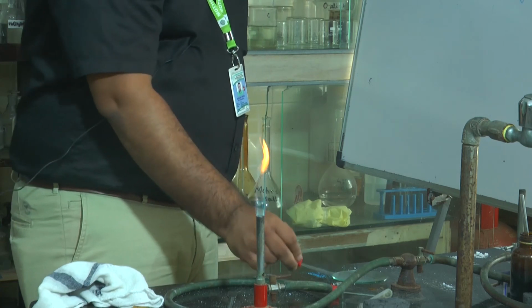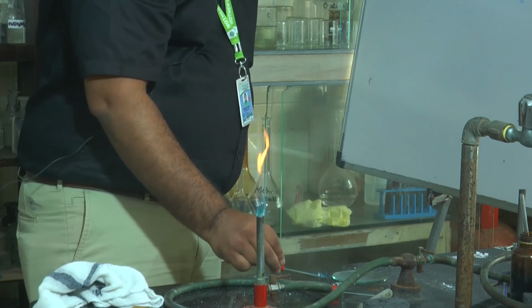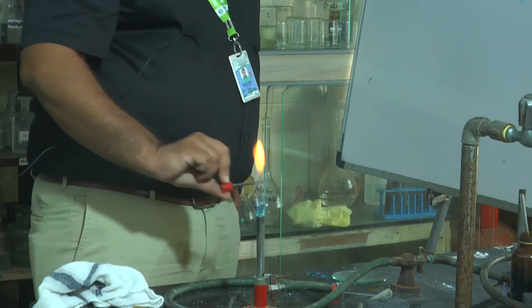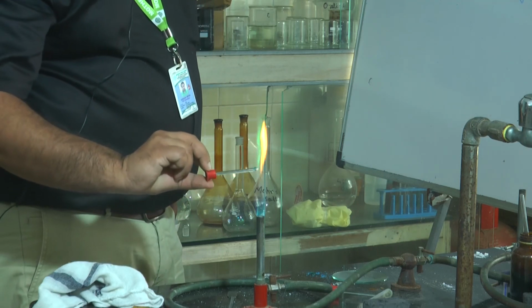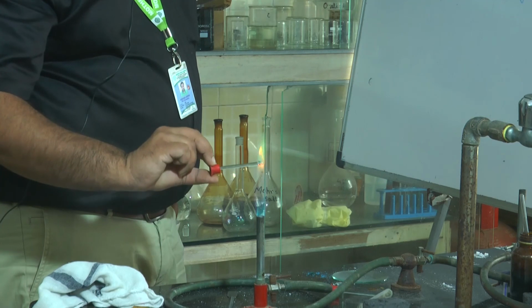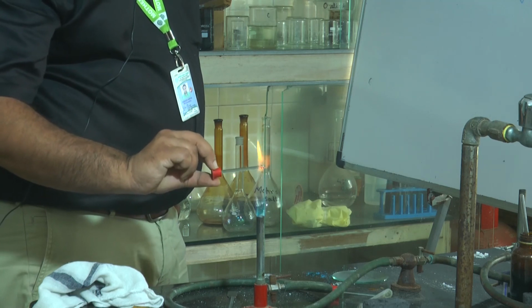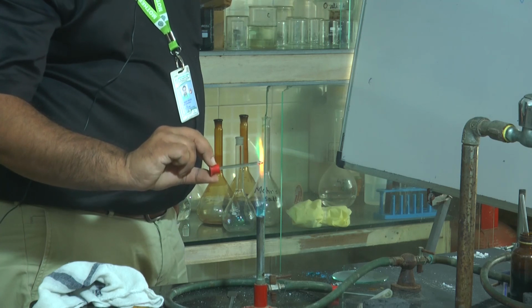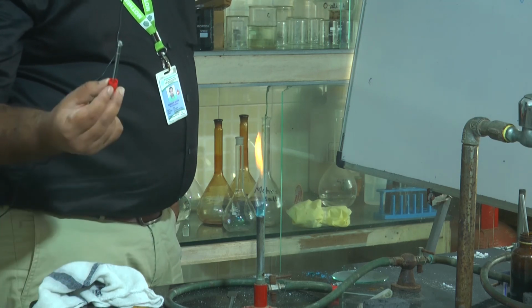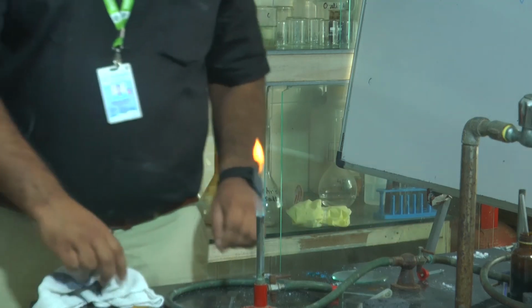Okay, next. If I am showing this, look, this is completely green color, bright bluish green. It is a mixture of blue and green, so that is the presence of copper ion. So this is our flame test.